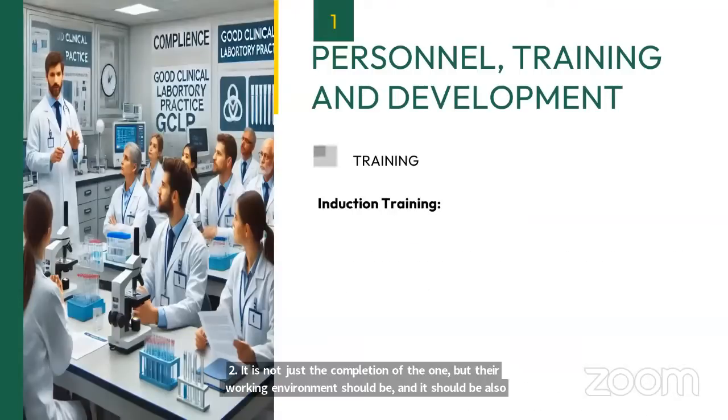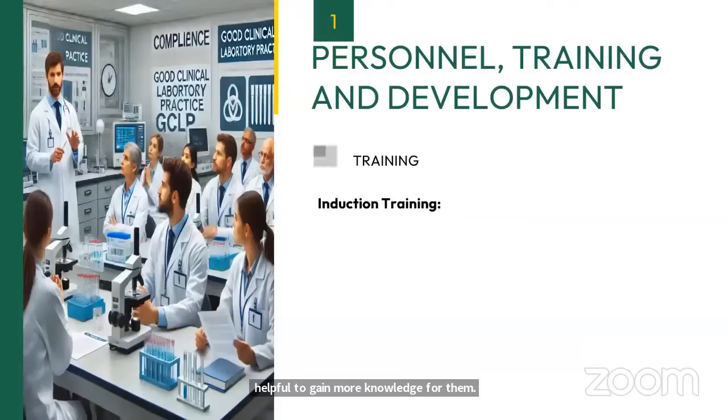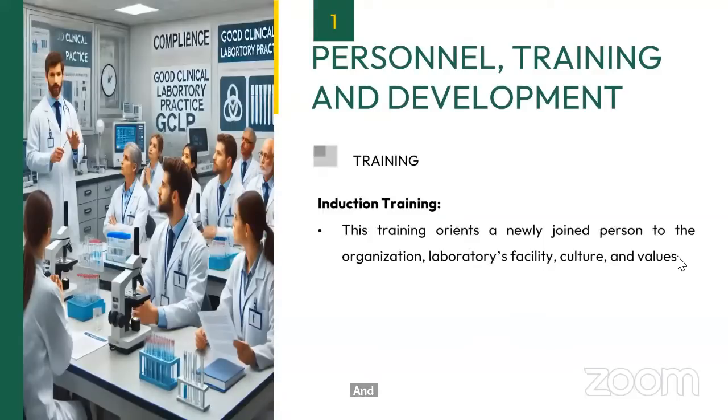Now, as I have mentioned, two types of training: induction training and on-the-job training. First of all, we will see what is induction training: laboratory facilities, culture, and values. So this is just an introduction.